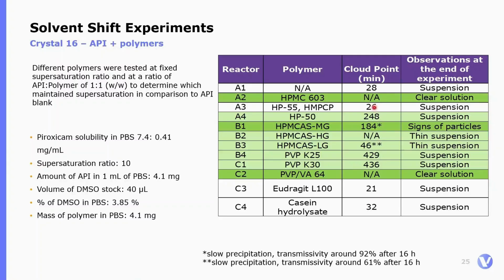Other extended stabilities for several hours before crystallization began. At the end of each experiment, we recorded visual observation of the samples. This gave us valuable insight into how much Piroxicam had precipitated, so we could rank the polymers in terms of their abilities to stabilize the supersaturation state.